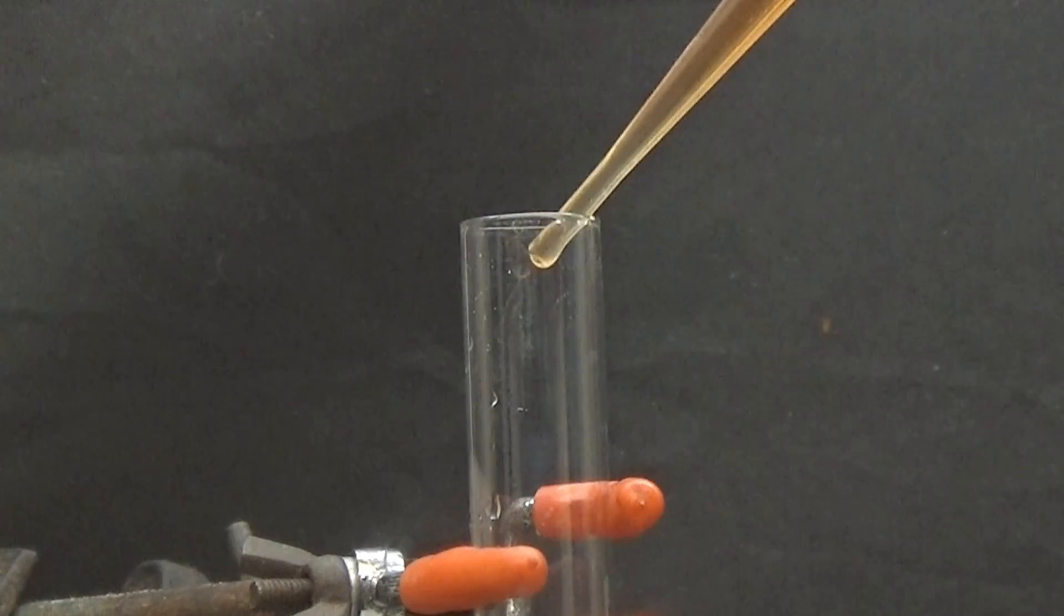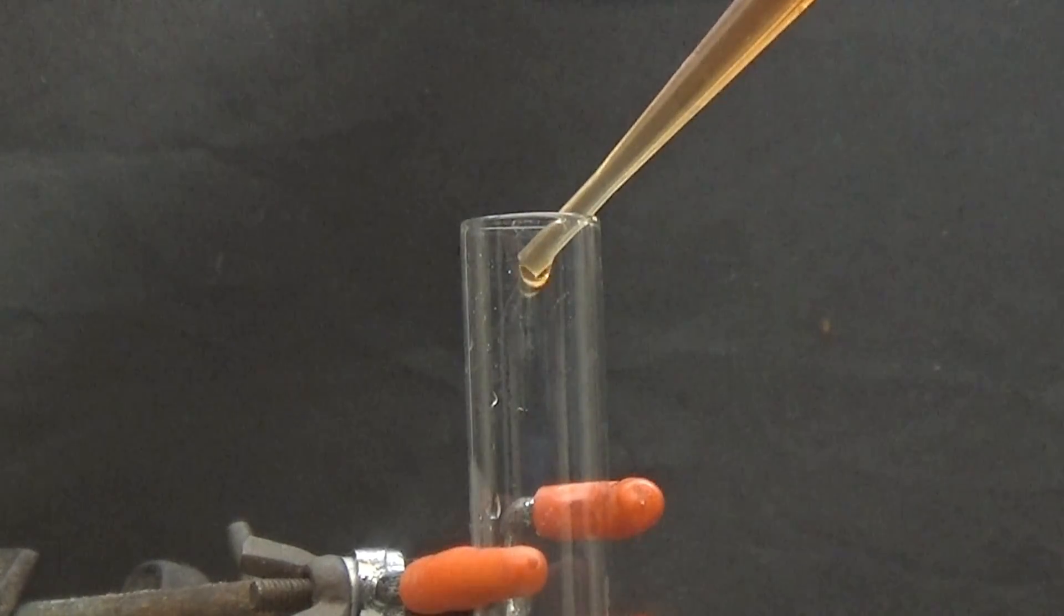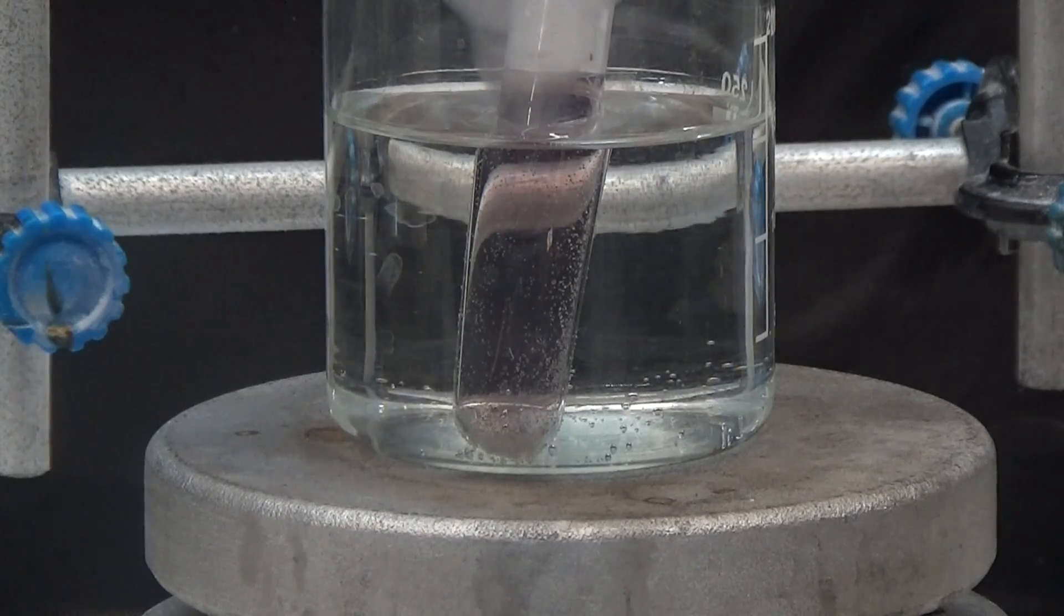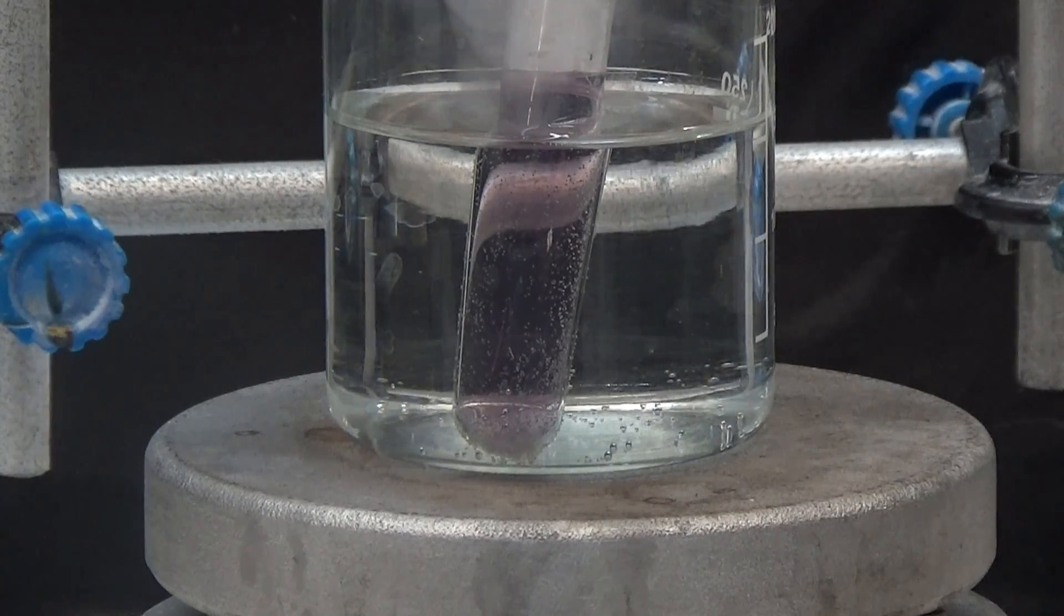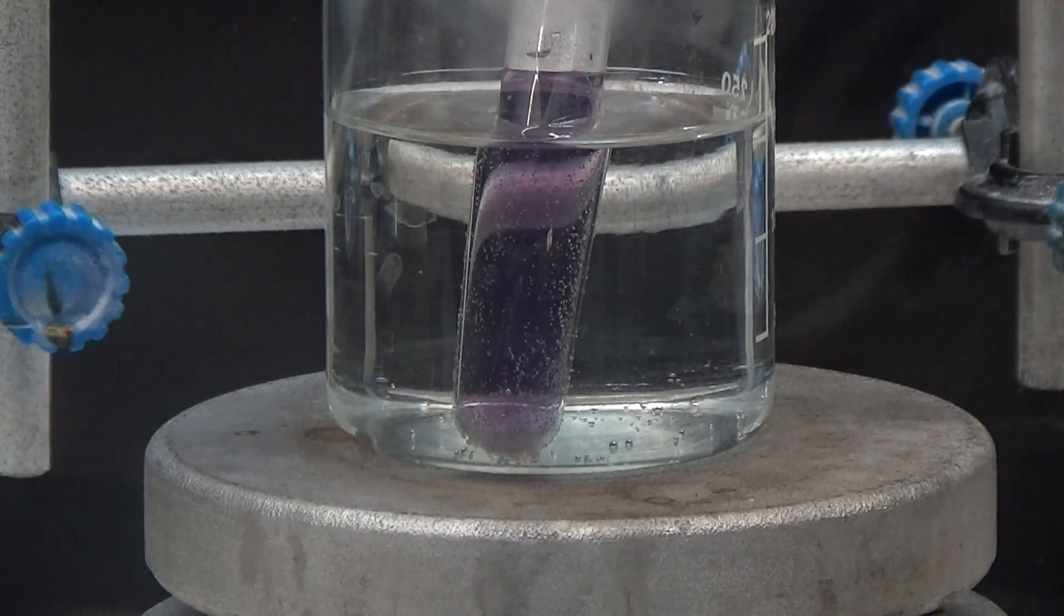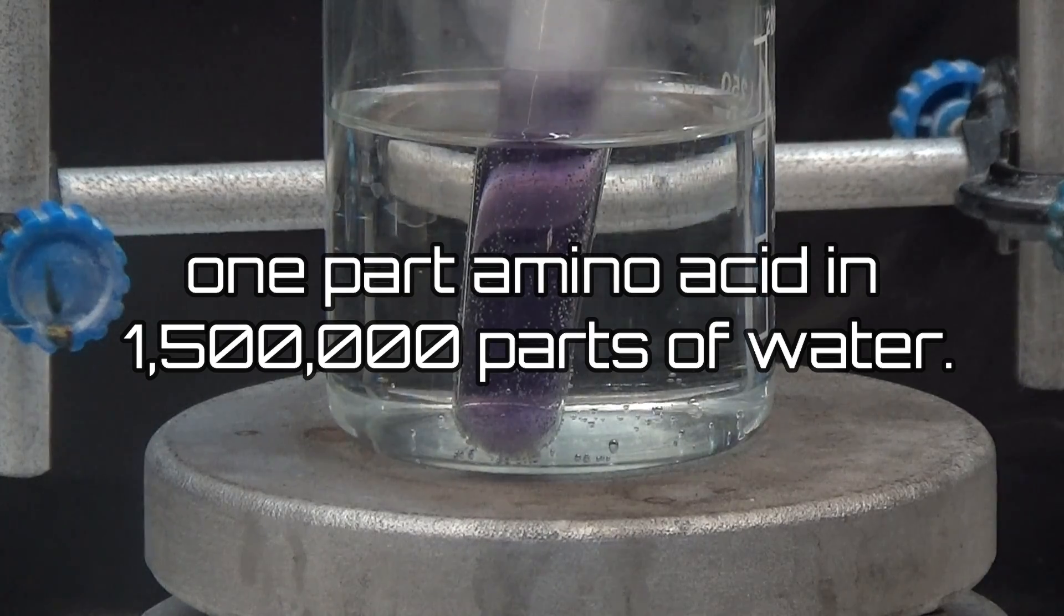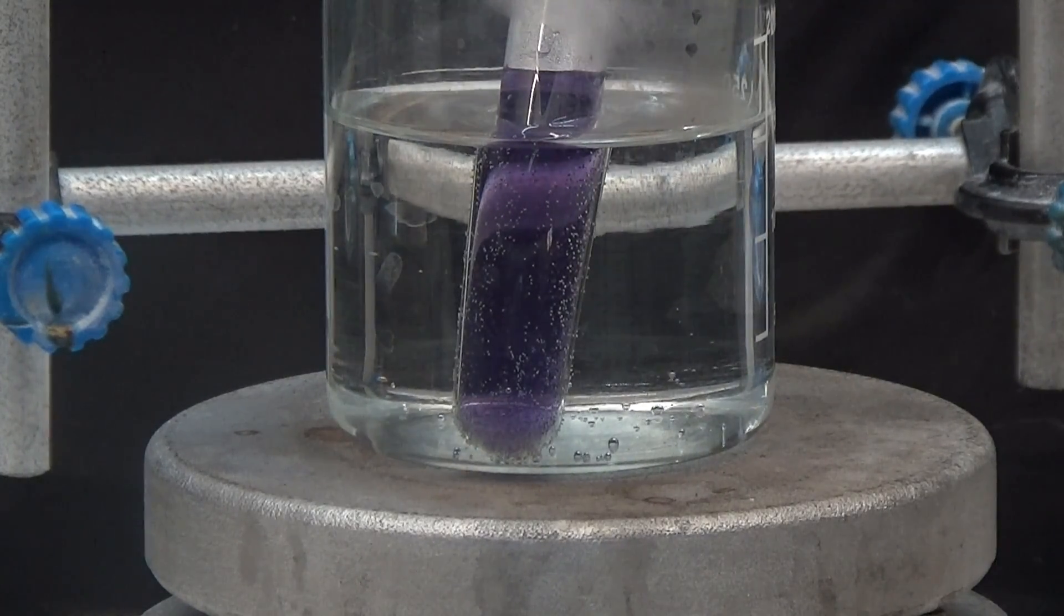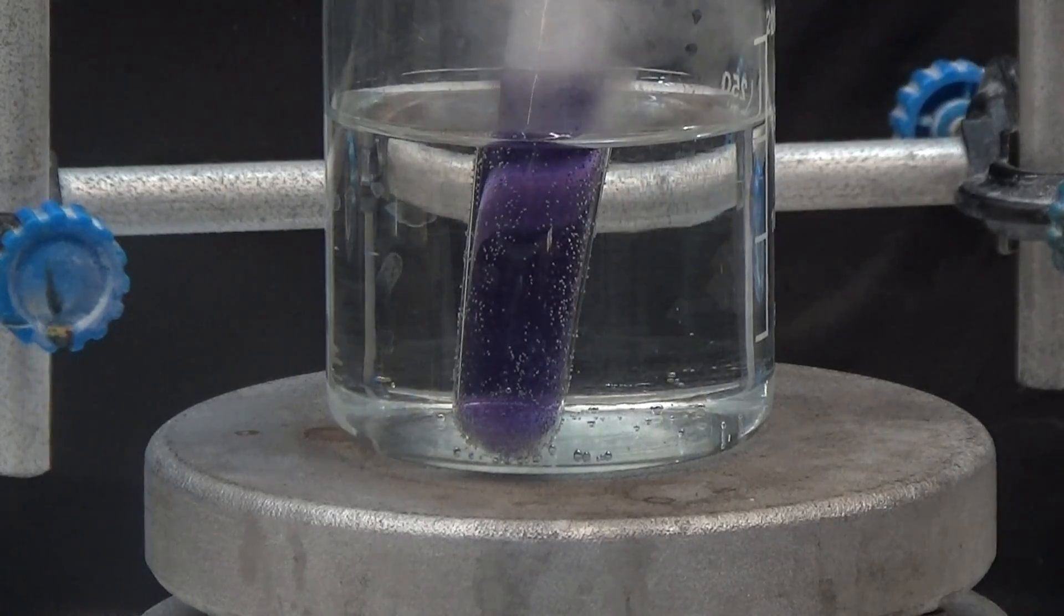We add about 6 drops of 2% ninhydrin solution and heat it in a water bath for 5 or 10 minutes. If the result is positive, the solution changes color to a deep blue or violet. This test is very sensitive, detecting one part of an amino acid in 1,500,000 parts of water. In instances where the biuret test is inconclusive, the ninhydrin test is positive.